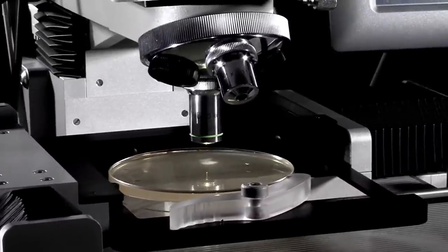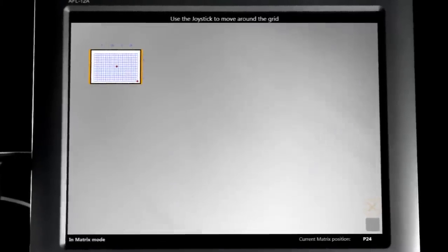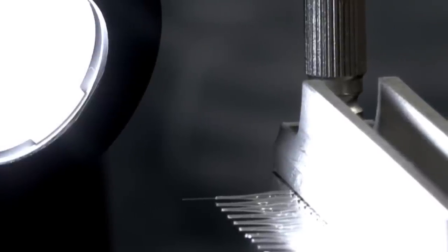Inoculum positional recall. Advanced image capture. Data export. We make the needles so you don't have to.